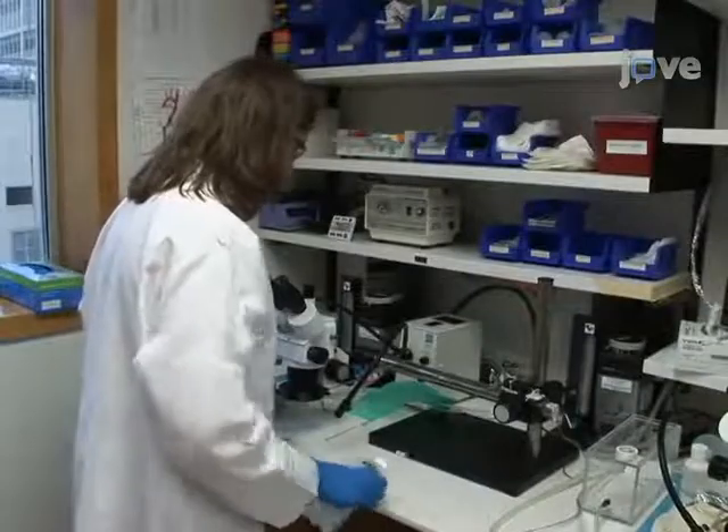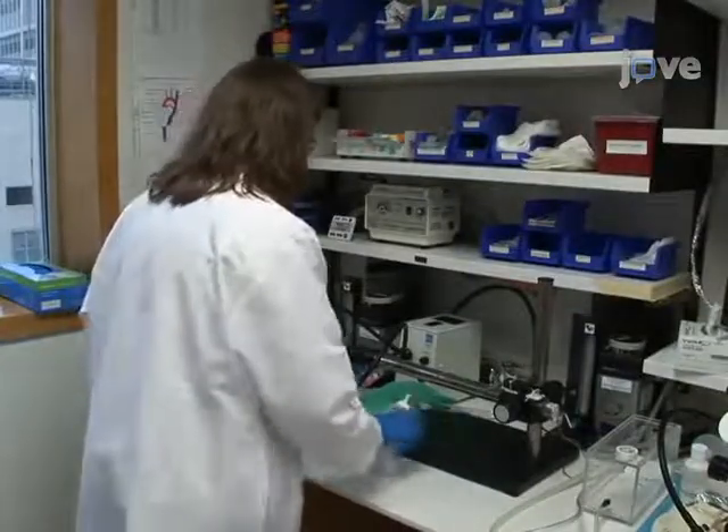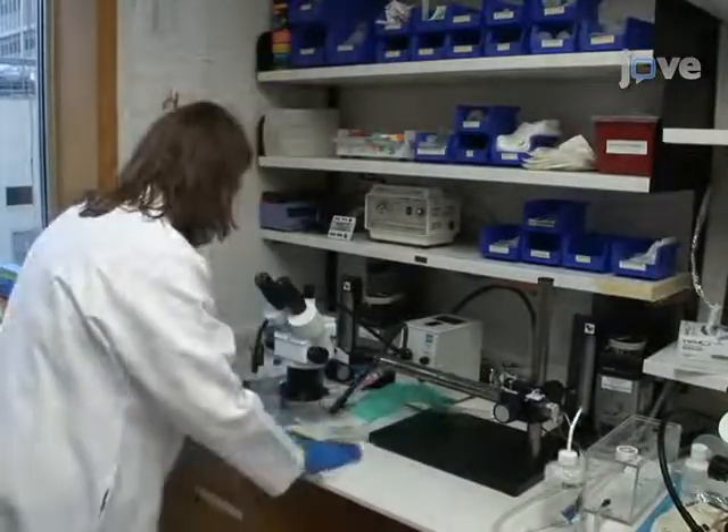So, let's get started. Prior to beginning transverse aortic constriction, or TAC surgery, disinfect the operating field with 75% isopropyl alcohol.